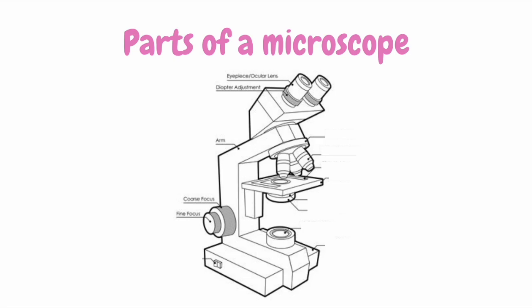Near the bottom of this microscope is the on and off switch to turn the microscope on and off. And some microscopes may have an element to adjust the intensity of the light as well. Then there's the base as well as the light source. Higher up, we can find the main part of the microscope, which consists of the diaphragm, condenser, stage clips or slide holders, and the objective lens and revolving nose piece.